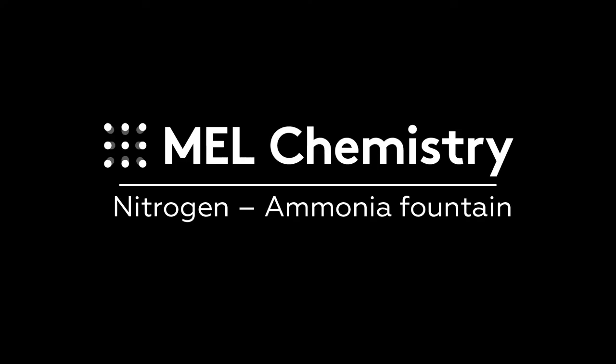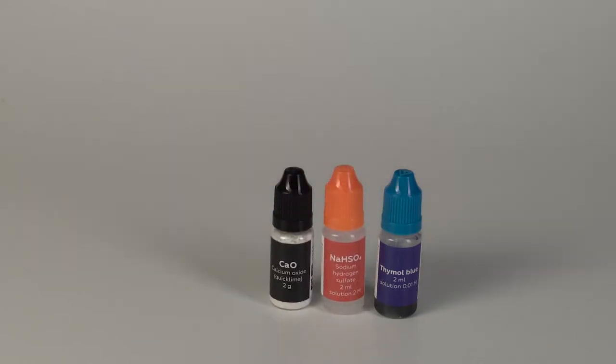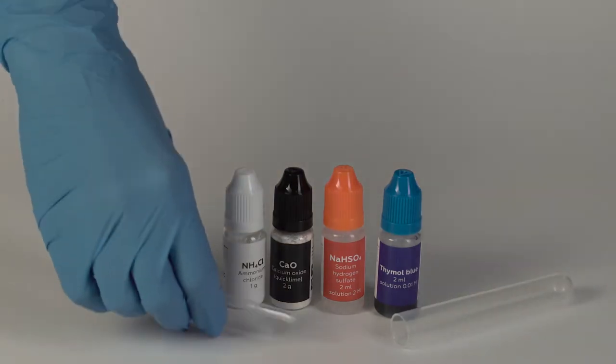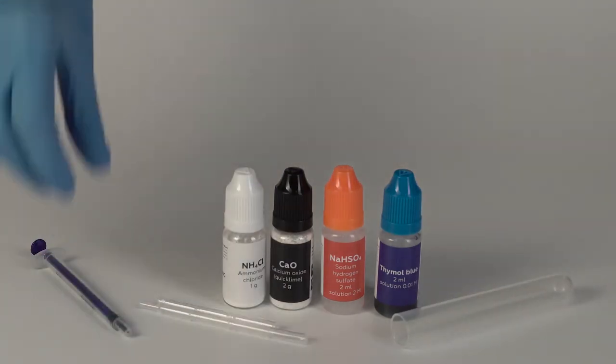For the ammonia fountain experiment, you will need the indicator thymol blue, the solution of sodium hydrogen sulfate, calcium oxide, ammonium chloride, a plastic bottle, two plastic tubes, and a one milliliter syringe without a needle.